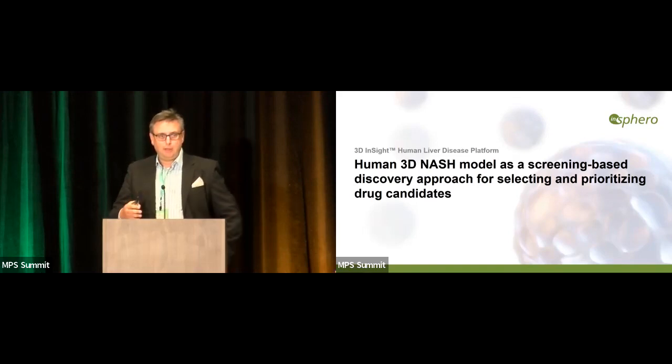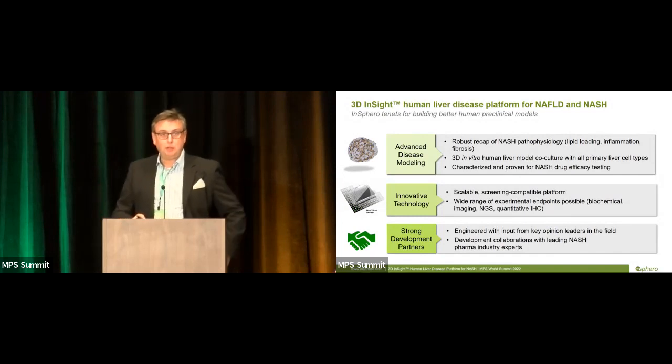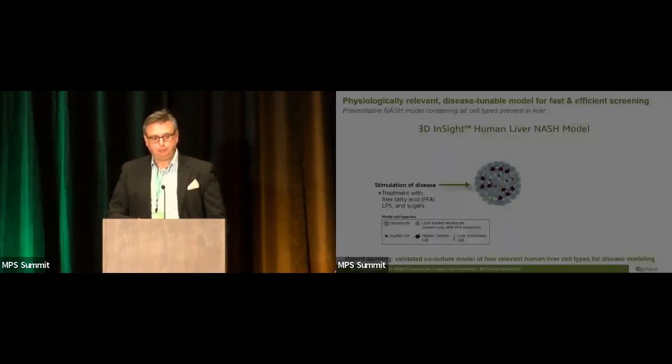And I think it's a great example of how 3D microtissues can be used to model a complex disease in vitro, and how we can read these systems out. So the three aspects that I'm going to touch on today are: how are we building this model and how are we stimulating the model to develop the disease phenotype? What are the endpoints and readouts that we're using to measure what's going on? And then how do we use image-based or machine learning-based image quantification to measure the complex morphology of the fibrils that are formed during that fibrotic step?